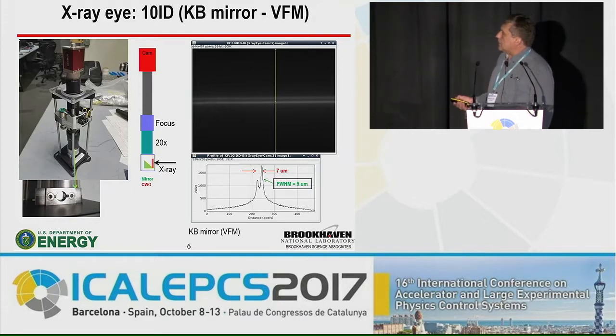The microscope is conventional up to this point, where we have a first surface mirror, and then we have a scintillator. I prefer to use cadmium tungstate, high Z scintillators, because the stopping power is very high. The fact that we see two streaks here is because in the first implementation we used the second surface mirror. Don't make that mistake. Use the first surface mirror here.